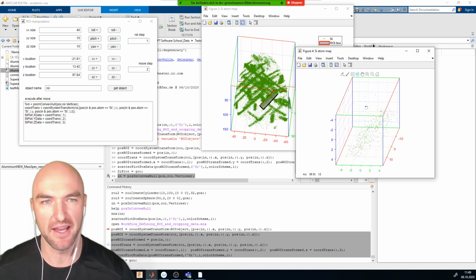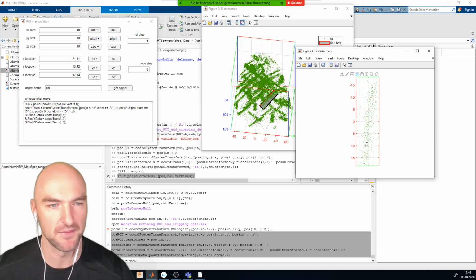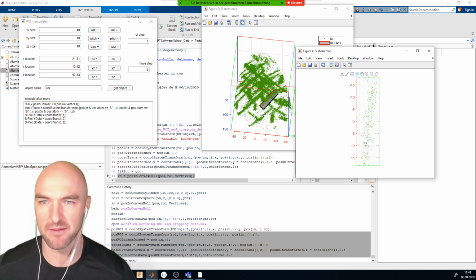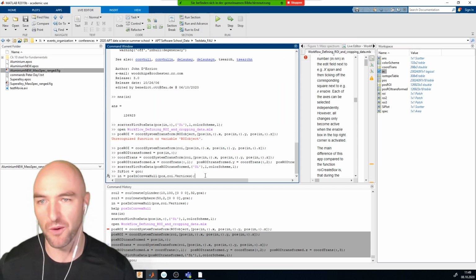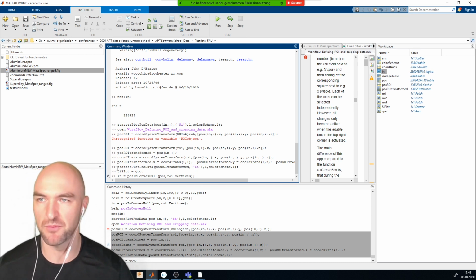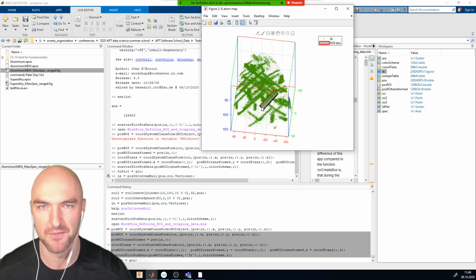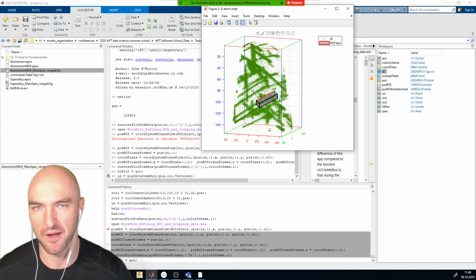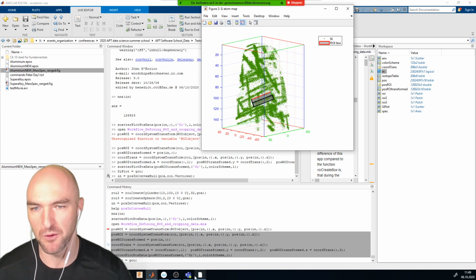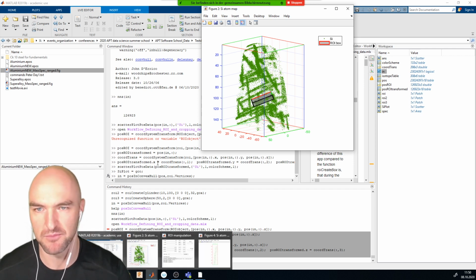And I probably should have taken the downsampling approach. Then all of this is a whole lot snappier, and we actually have enough time to do that. So let's maybe just do that then. Well, one thing we can very easily do is just use the silicon atoms. Because if we just use the silicon atoms, then there is not a lot of them, so we can use all of them. We can still use all of them in the display here, but when we do the alignment of the box, we might just use the silicon atoms.